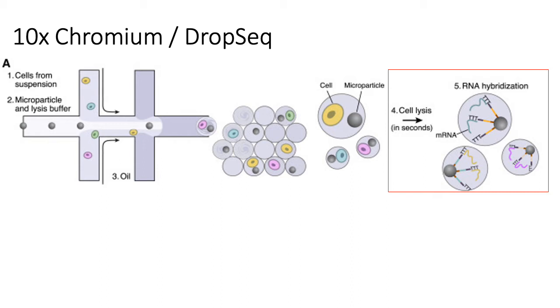But on the other hand, as we'll again see later, every primer also has what's called a UMI, or unique molecular identifier, where hopefully every primer has its own unique UMI for a given bead.